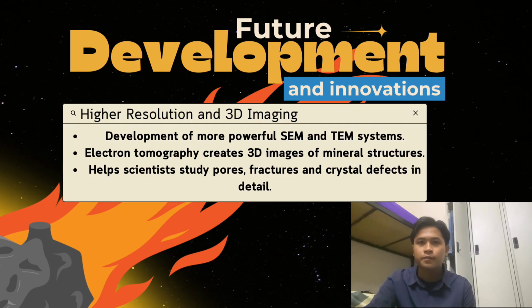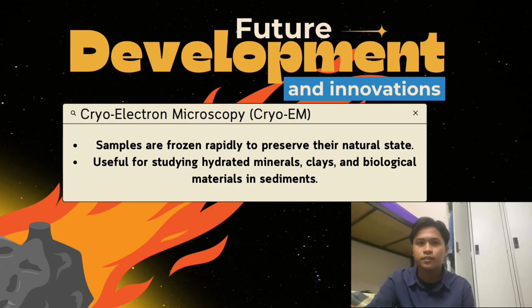This enables researchers to study pores, fractures, and crystal defects in greater detail, which is important for understanding rock formation, fluid movement, and material behavior.